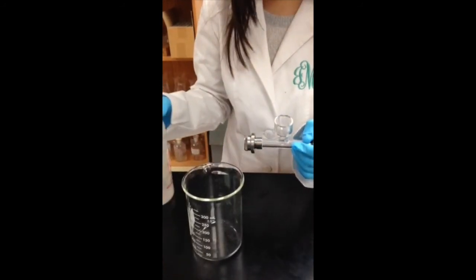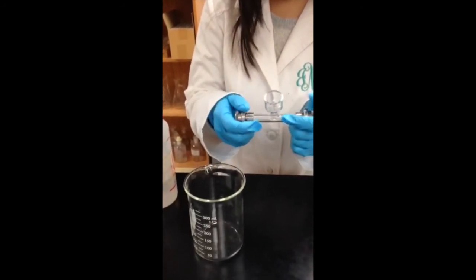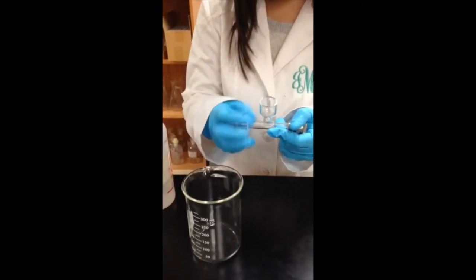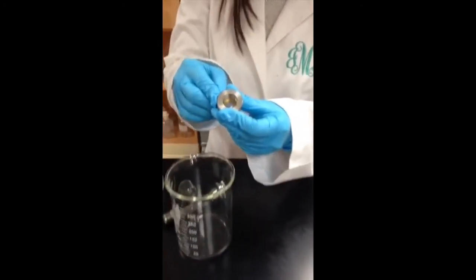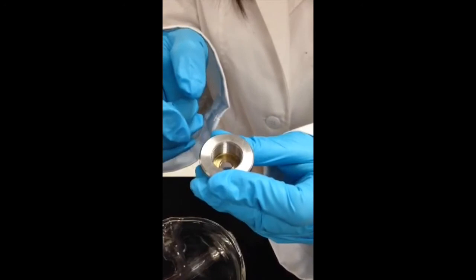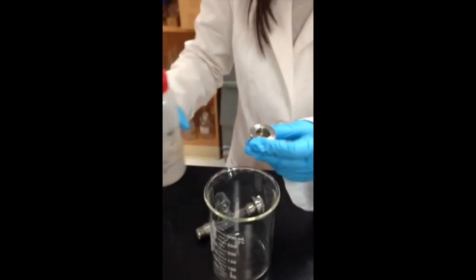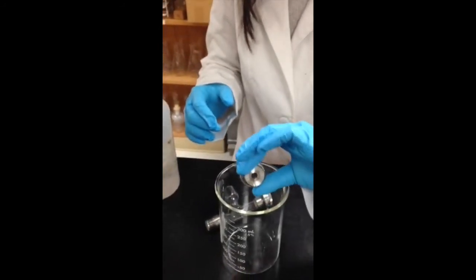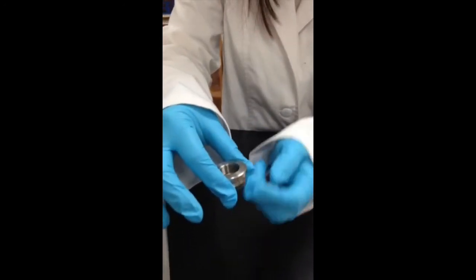If you are the last one using the polarimeter, you will restore the cell into the box. First thing you do is take the ends apart by unscrewing one at a time. Inside the end, it has a piece of glass. Make sure you do not drop it. Use the acetone to rinse the inside 3 times. Now you have 3 pieces of the cell all clean and dry. You will place them in the box. For the ends, place them like this, but not upside down, to prevent the piece of glass from falling out.